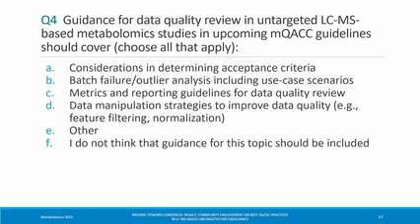So we try and ensure data quality over large batches by, we can talk about the analytical, but I would go back to planning is essential. And I think, yes, we can talk about QCs, and we definitely use these, and we use redundant QCs, but we also use other strategies such as protocols and quality checking of biobank samples, and this is an essay in itself. Well, for an essay in itself, very succinctly put. Good job. All right.